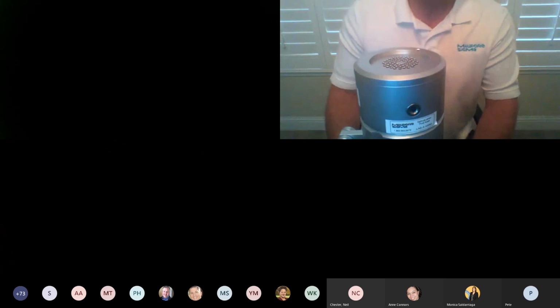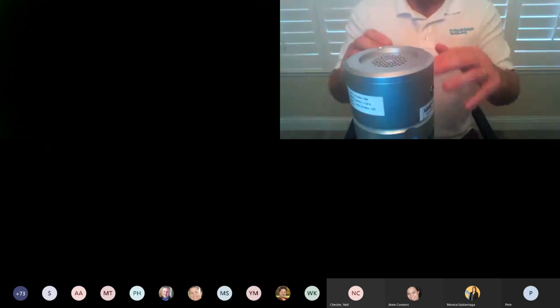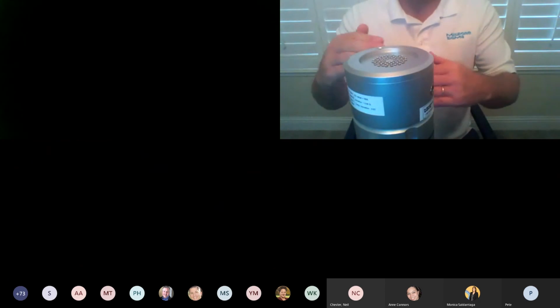What controls during the calibration to ensure there is no interference? Well, Amber, it's okay. I mean, it's air, so we're not talking about chemistry. As long as you are within your plus or minus 2.5, that's what we're calibrating to. So if I'm at 104.6, 105.1, 105.4, that's why we do an average, and that average is fine.